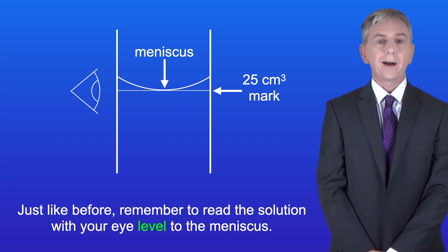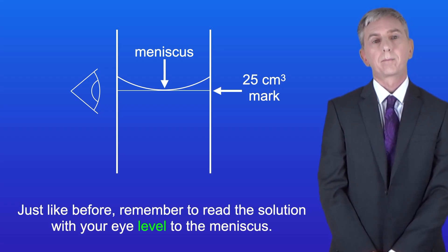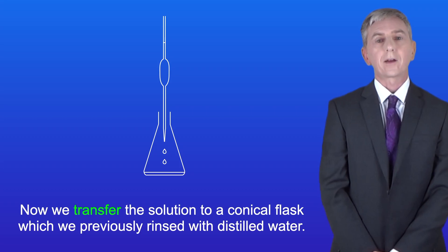Just like before, remember to read the solution with your eye level to the meniscus. Now we transfer the solution to a conical flask, which we previously rinsed with distilled water.